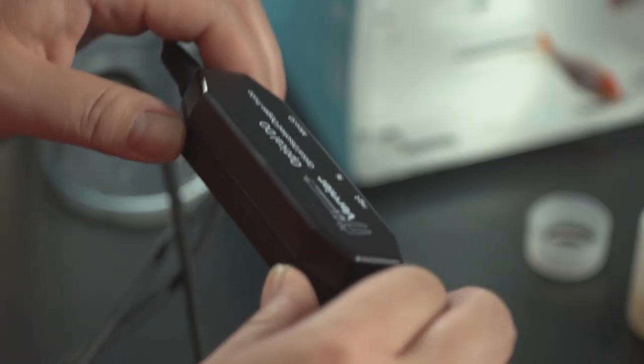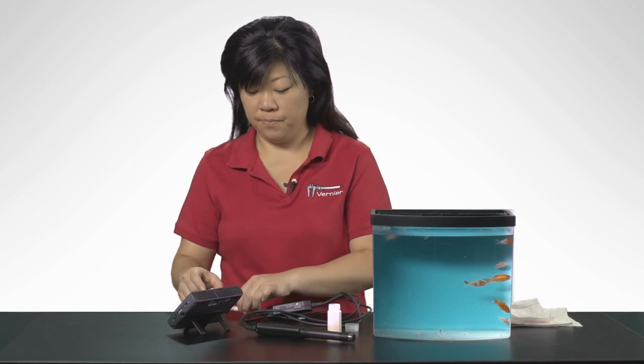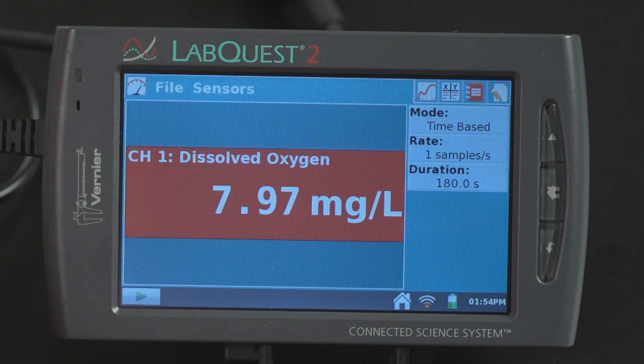To prepare the optical DO probe for use, make sure the storage bottle is removed. Position the switch to either the milligrams per liter or percent saturation setting. Connect the optical DO probe to LabQuest 2. The optical DO probe will auto-ID. You are now ready to collect data.